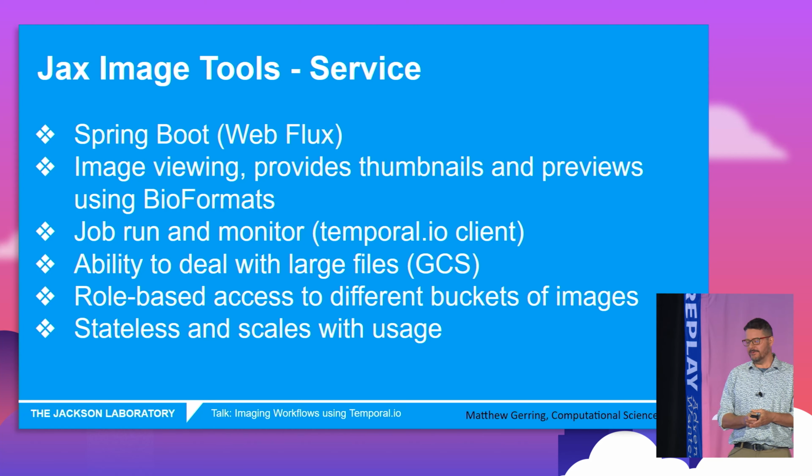So Bio-Formats is a library that allows you to read any microscope and other image formats. As you can imagine, there's a whole load of vendors with all of their instruments, and Bio-Formats is a library that the open source community tries to keep up to date to read all of those file formats. Some of those file formats are what's called pyramid files, where they'll have a very high resolution image and then a stack of lower resolution images going up, because it's so hard to interact with these data. The data are so large, they don't fit in memory.